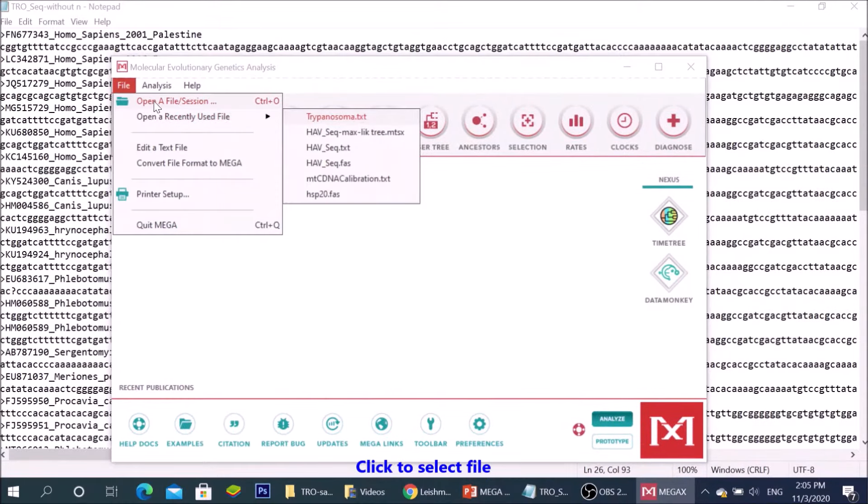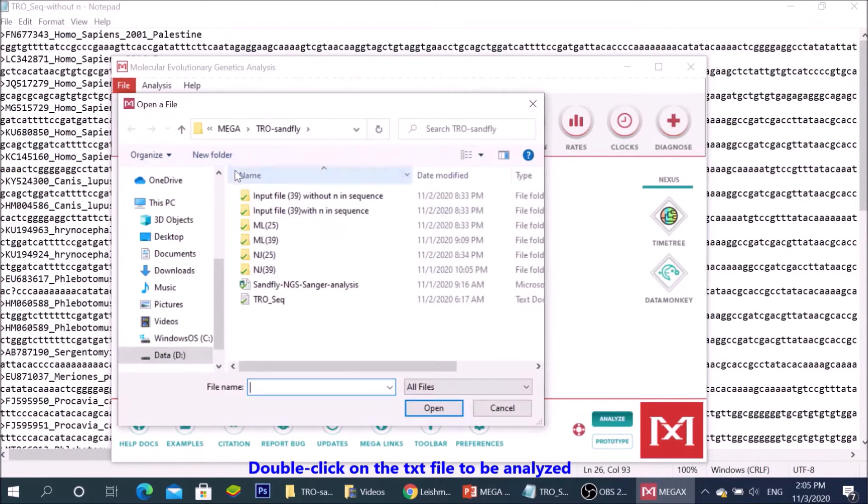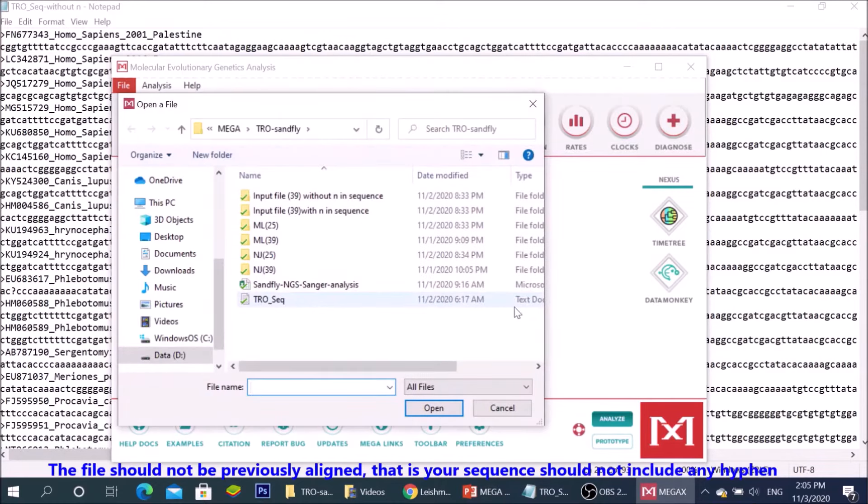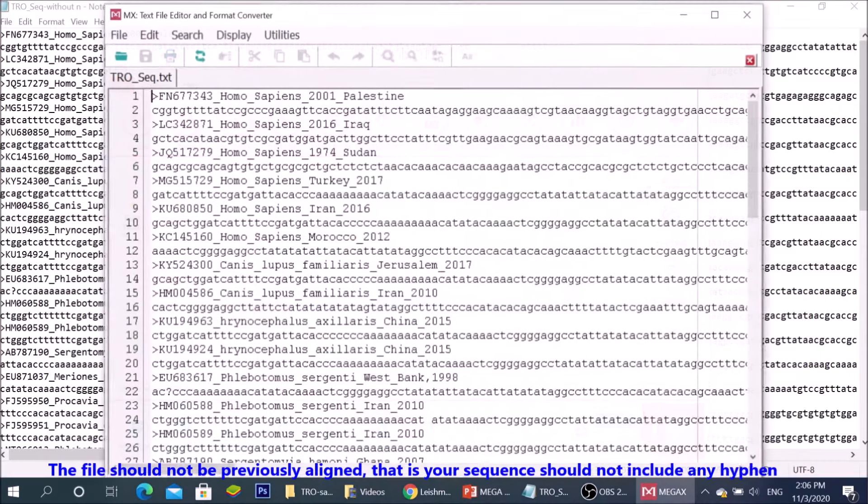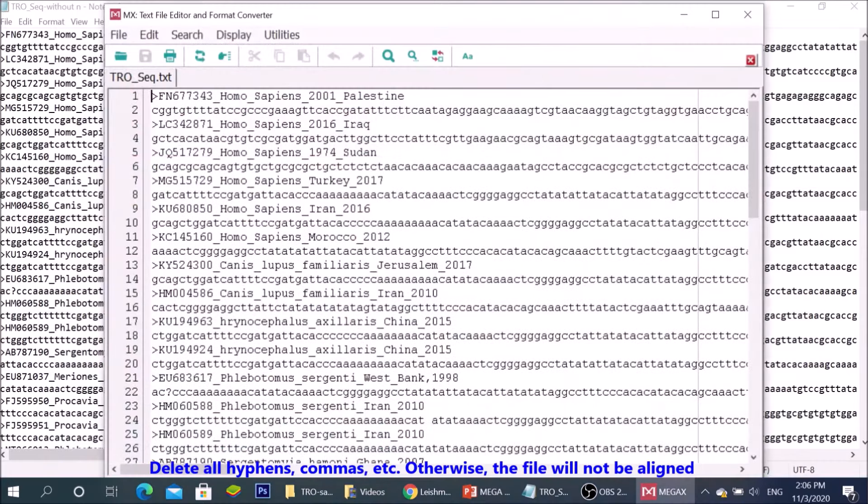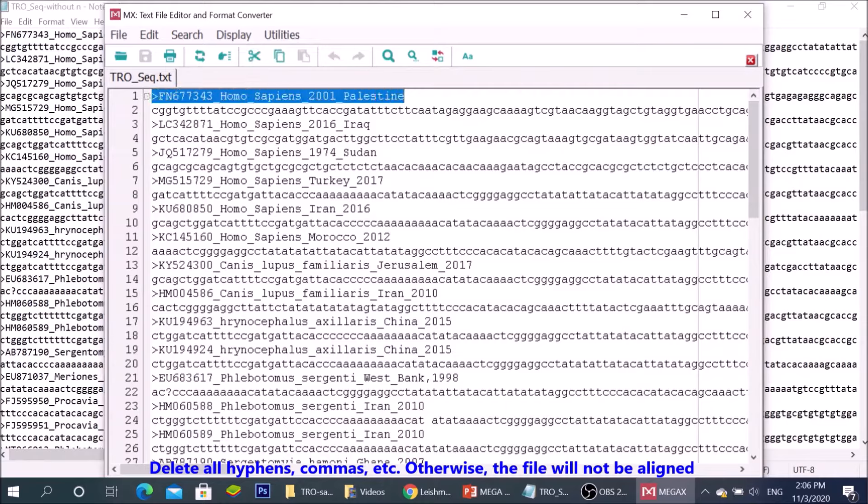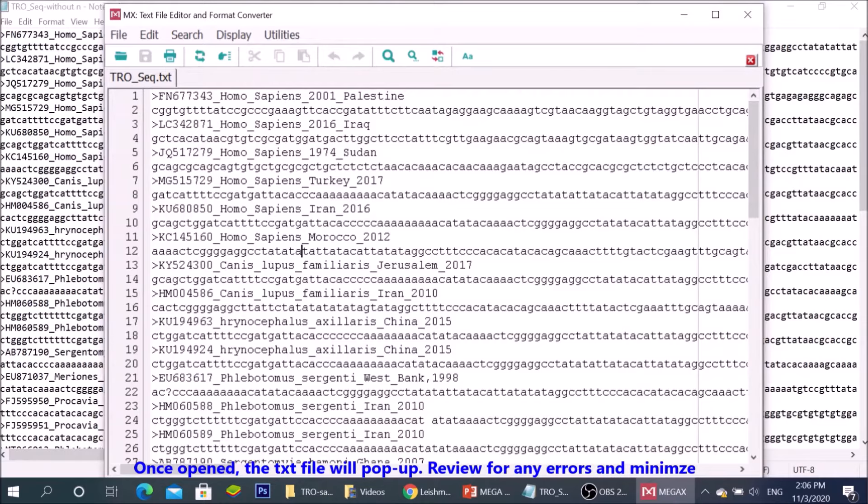Click to select file. Double click on the text file to be analyzed. The file should not be previously aligned. That is, your sequence should not include any hyphen. Delete all hyphens or commas. Otherwise, the file will not be aligned.